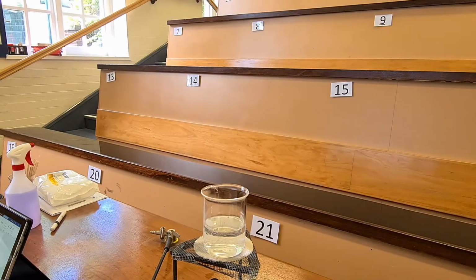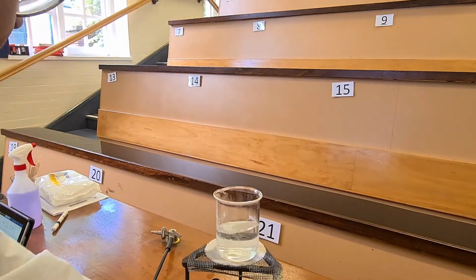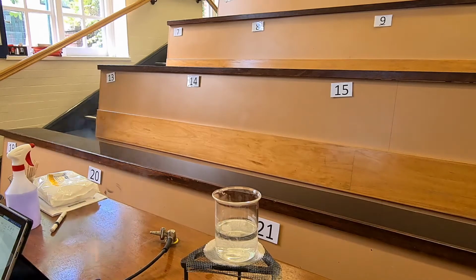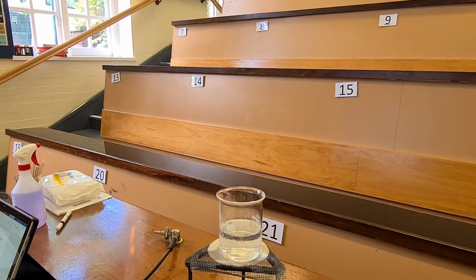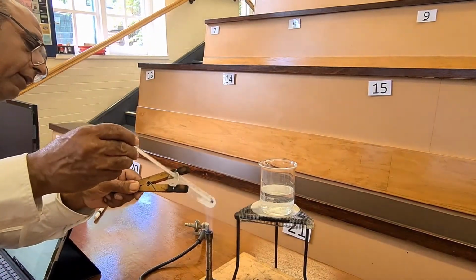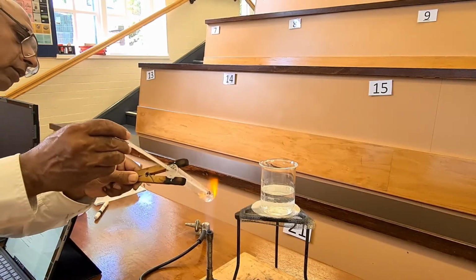Just to speed things along, I'm going to do something that's not so standard. I'm going to heat it directly, to get it to dissolve. Can you see? Heating it directly. Hope you can see. Right, okay. So that's a Bunsen burner. Heat it directly to get it to dissolve.